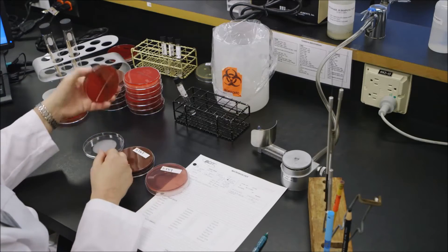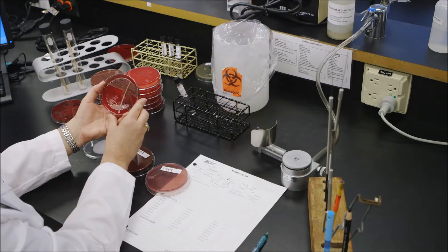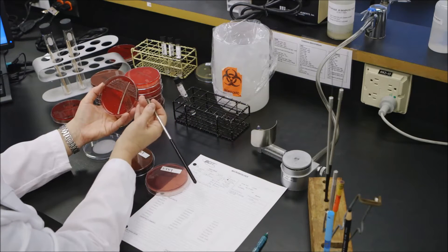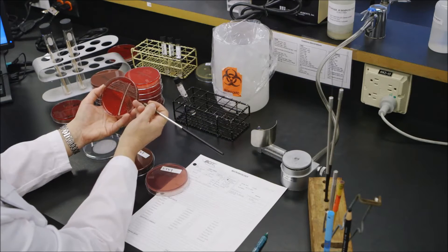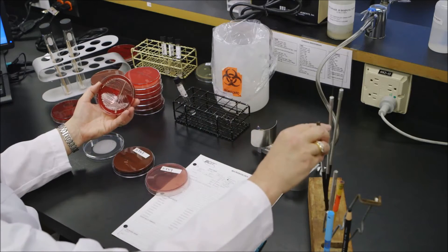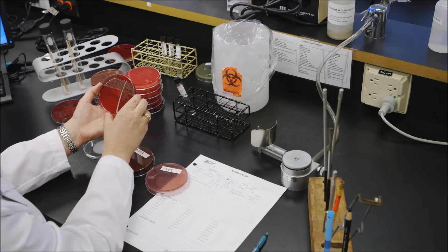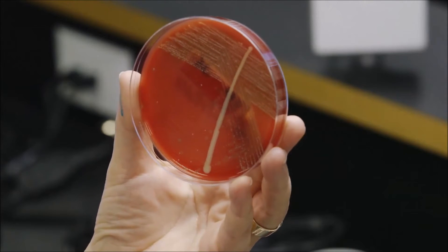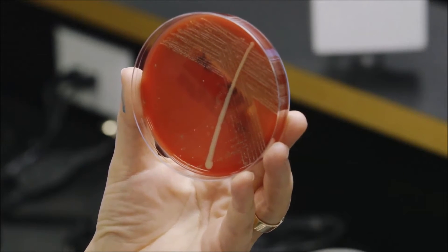When I look on the blood agar plate I don't see anything that looks like that medium-sized colony, tan gray. The only things I see mostly on that plate are alpha hemolytic organisms and some non-hemolytic organisms.